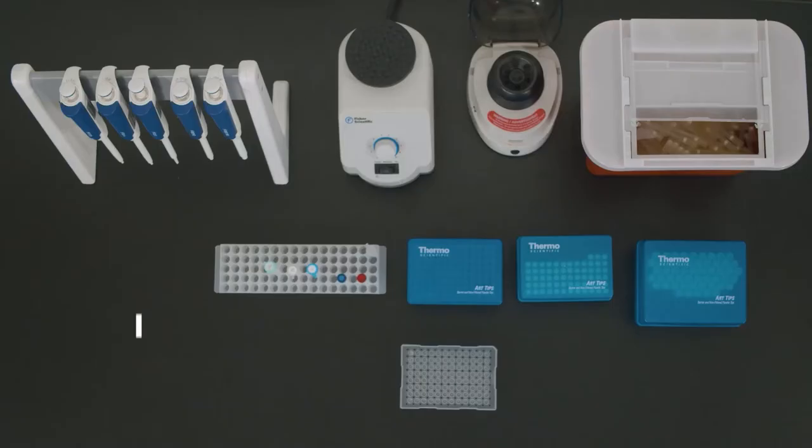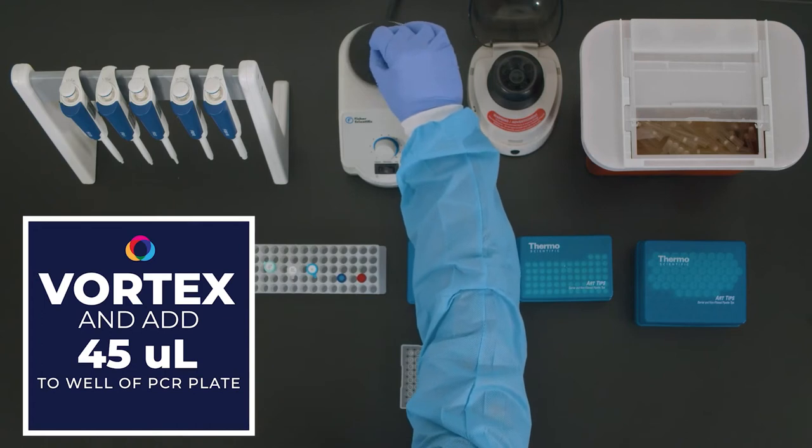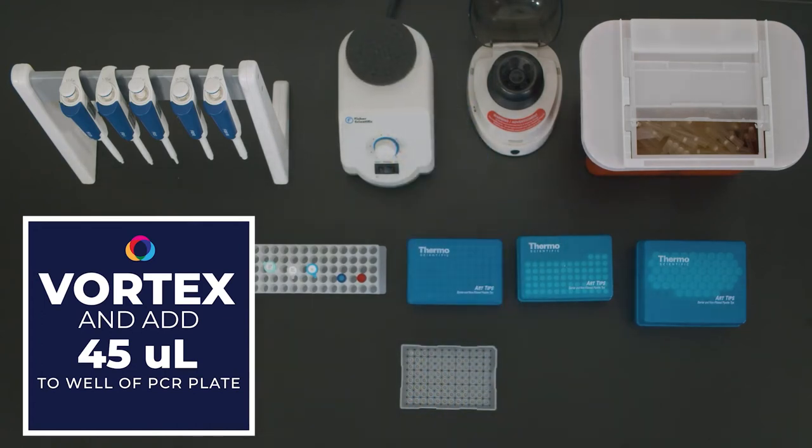Once the MasterMix is created, vortex and add 45 microliters to the designated wells of a PCR plate.